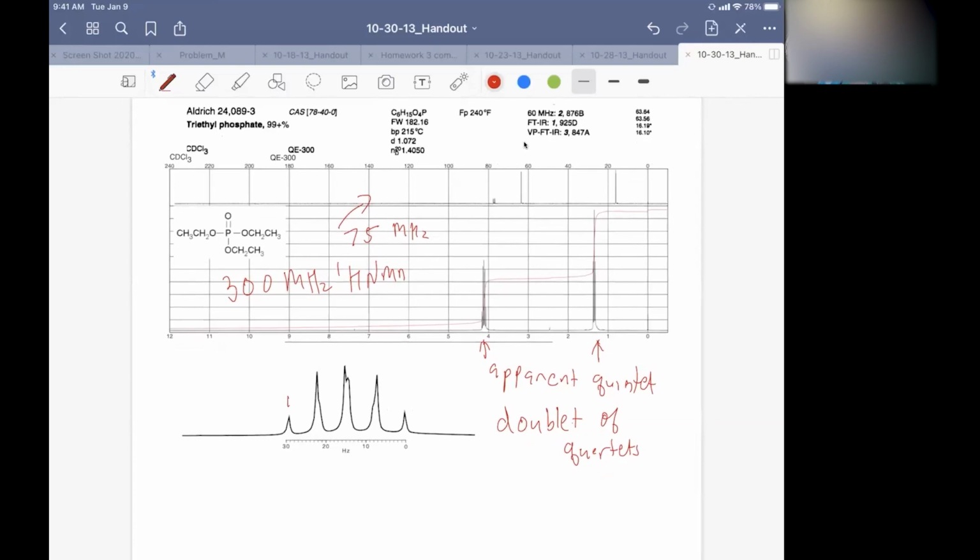I didn't really look at the Hertz coupling, which is probably the one to look at for the best evidence. Yeah. So you're starting to see them just ever so slightly separate. And you notice the heights of these lines kind of match up.